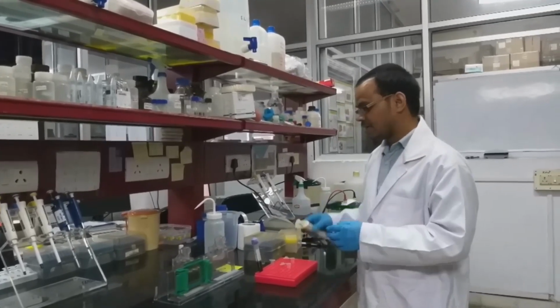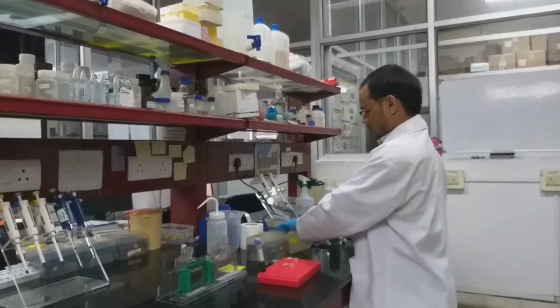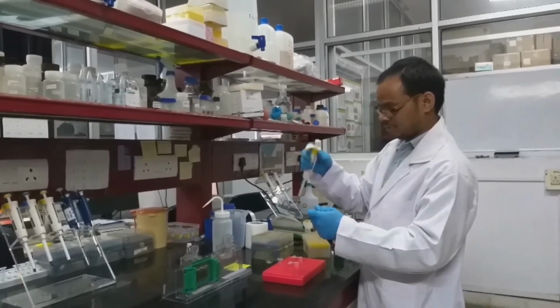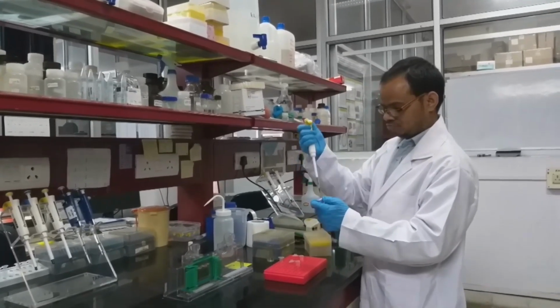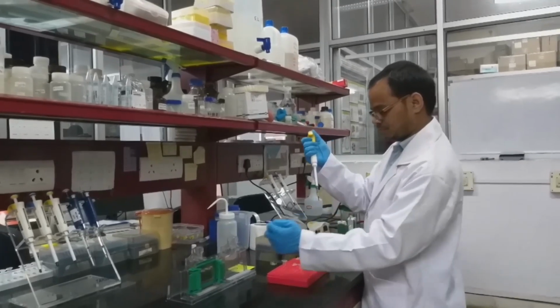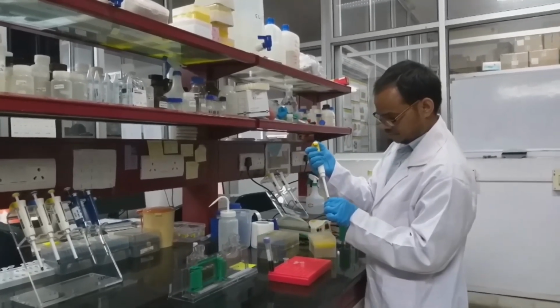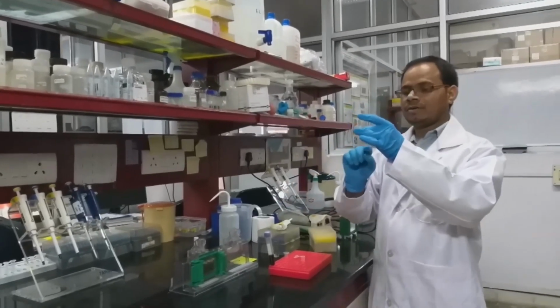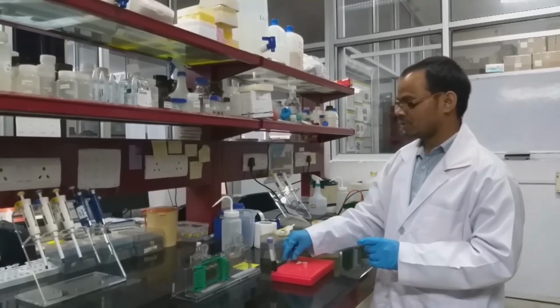We mix 10 microliter of loading dye to this protein solution. You can tap down or pipette this protein solution.